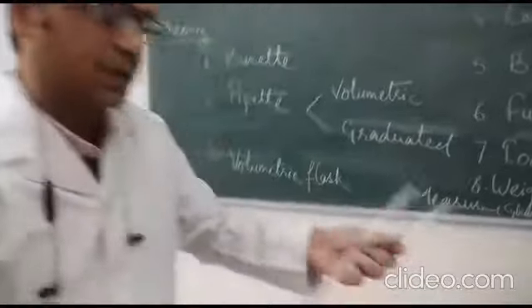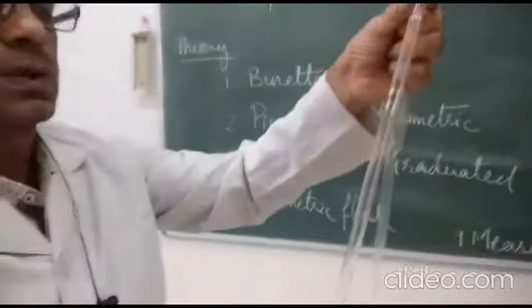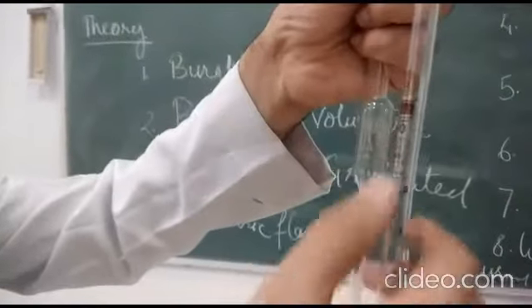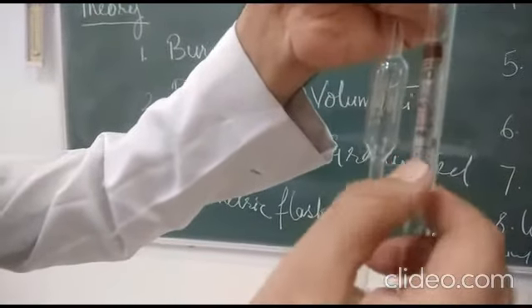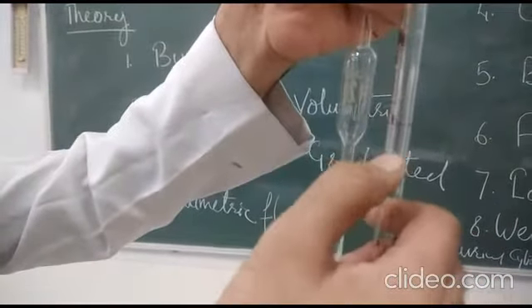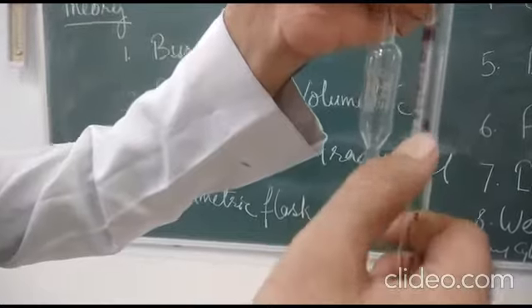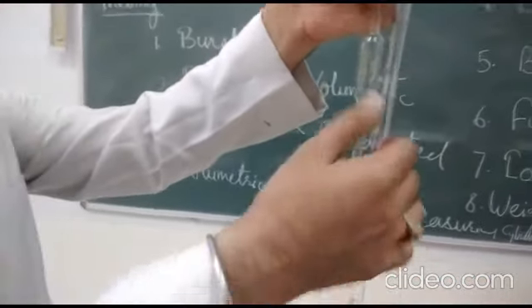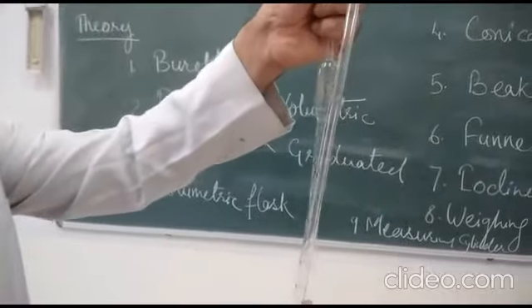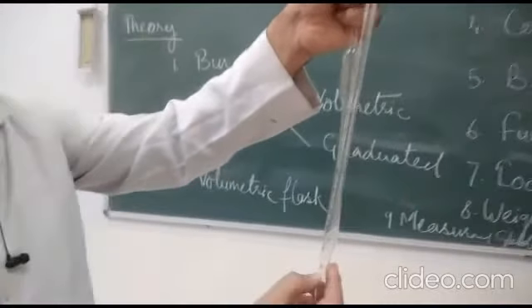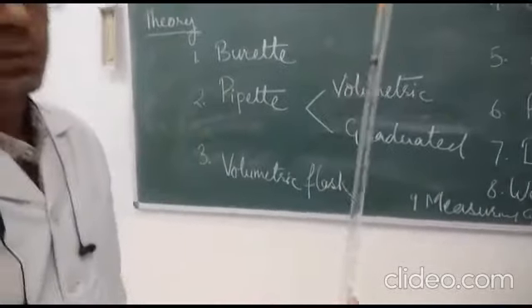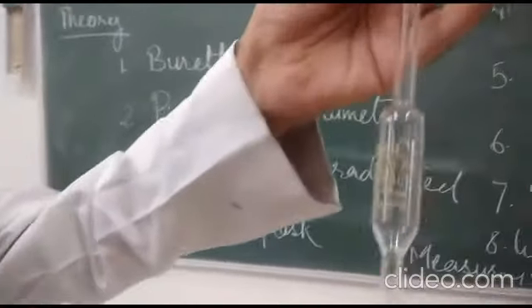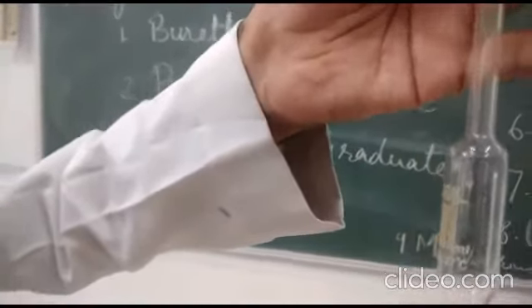Another type of pipette is the graduated pipette. You can see it has multiple marks. This one is of 10 ml. From 0 to 1 it is divided into 10 portions, and from 1 to 2 it is also divided into 10 portions — likewise up to 10 ml. This is termed a graduated pipette, while the other with a single mark is the volumetric pipette of 20 ml.